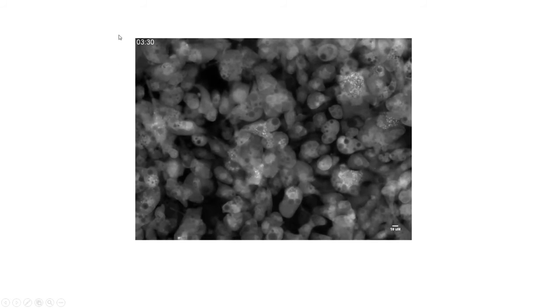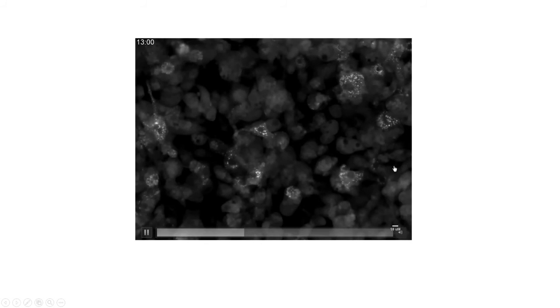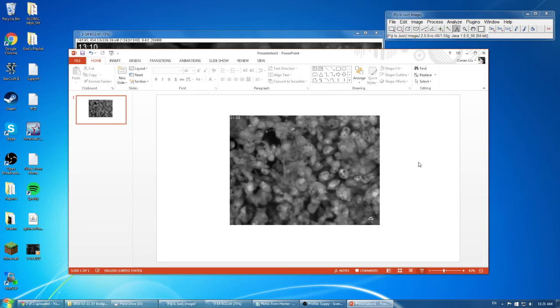And you can see on the top left we have a working time counter. We have the scale bar labeled on all slices, and we have it running properly. So this is a great way to present your ImageJ time-lapse data in a PowerPoint presentation. Now sometimes you're going to want to crop it too.